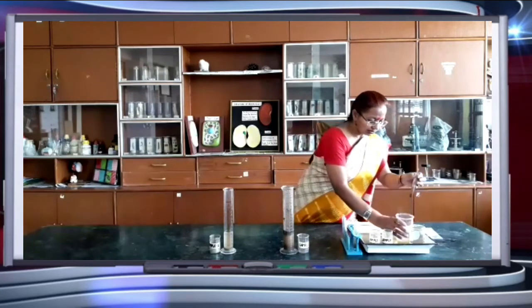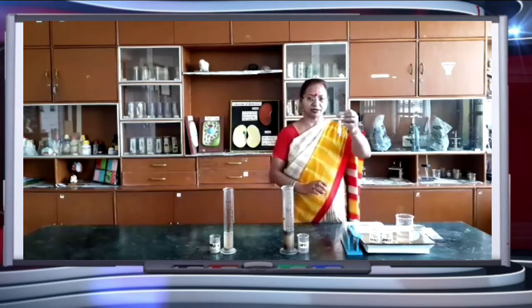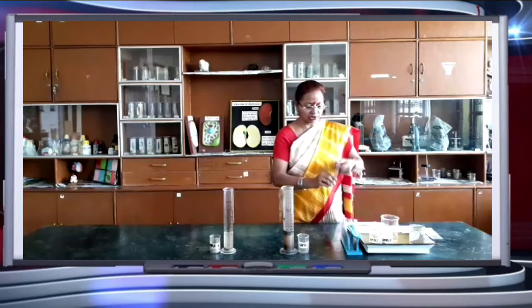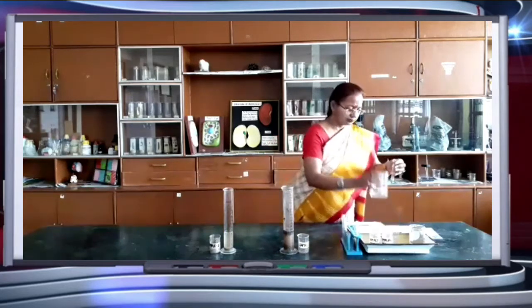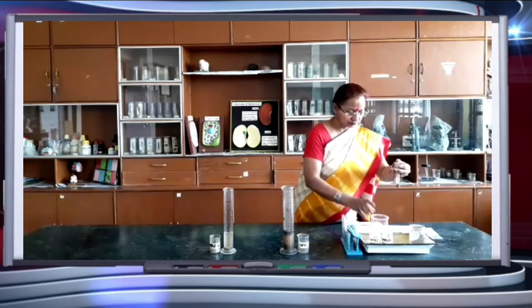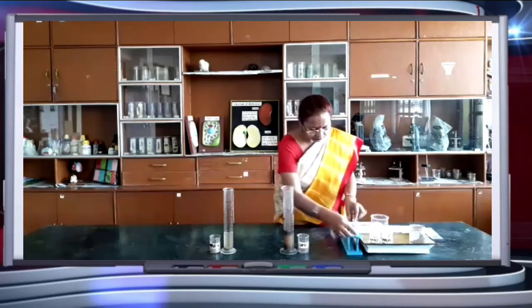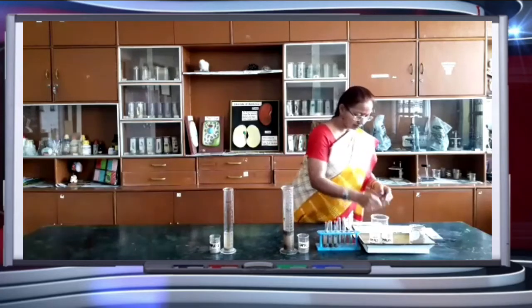Add water and leave it for 1 to 2 minutes. This is sample 2. This also we will check pH with the help of pH paper which we have already with us. And this is sample 3 of soil. Shake it well. You can see 3 test tubes with the 3 samples. Now this is pH paper.